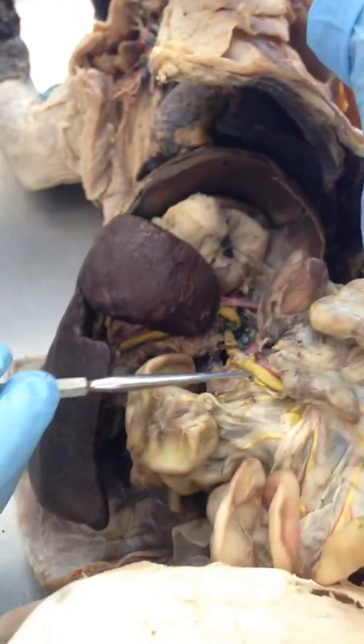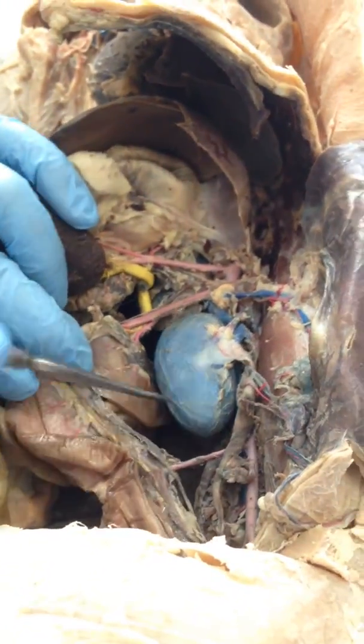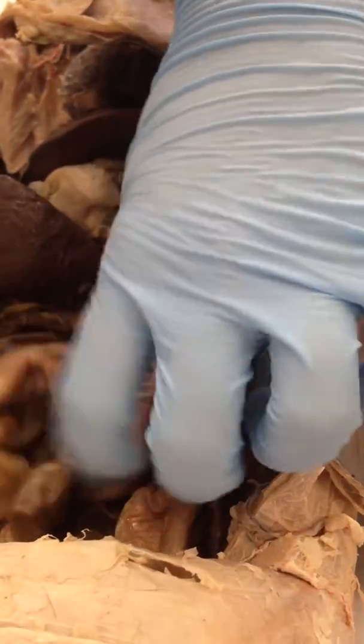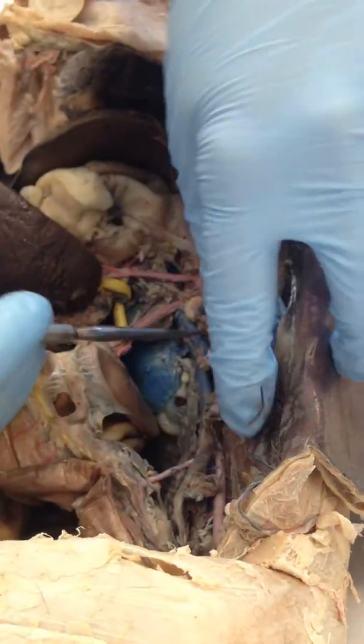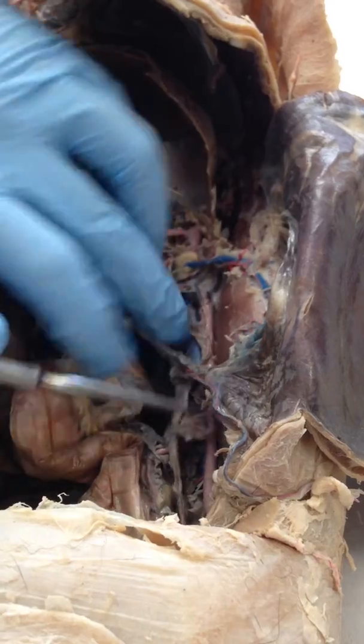The hepatic portal system is yellow, and then you had the superior mesenteric artery. Yes. And then the next one off the trunk, I don't know if it's the next one or not, but this one right here is the renal artery. Yep. And then following down, mine is kind of an ugly color. This is still the artery.